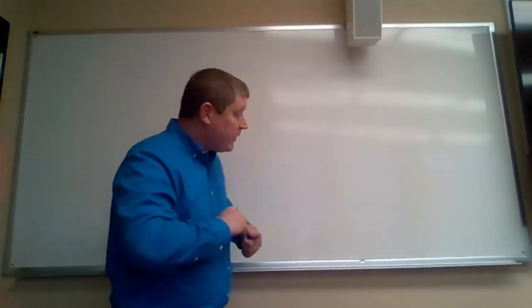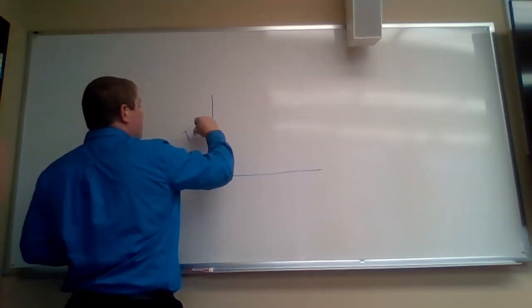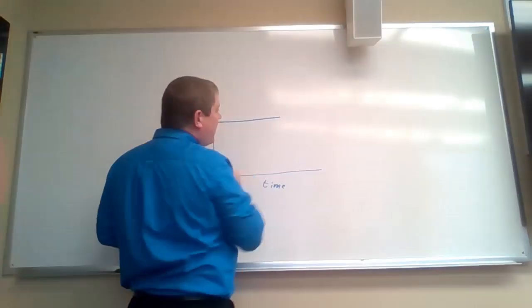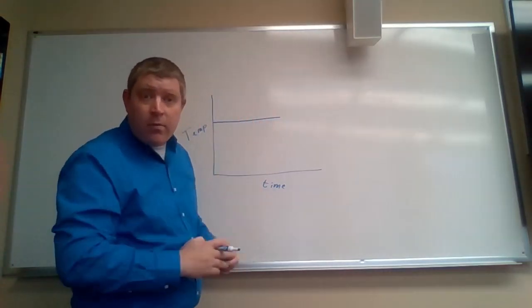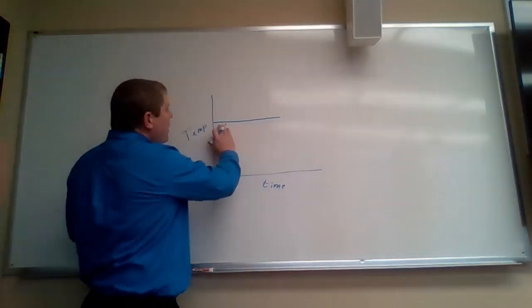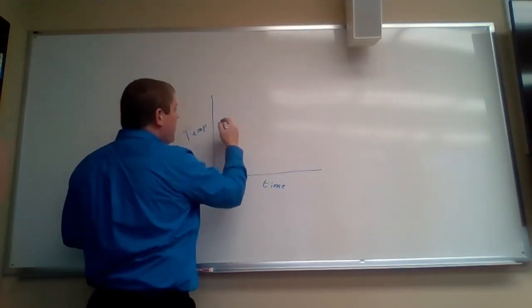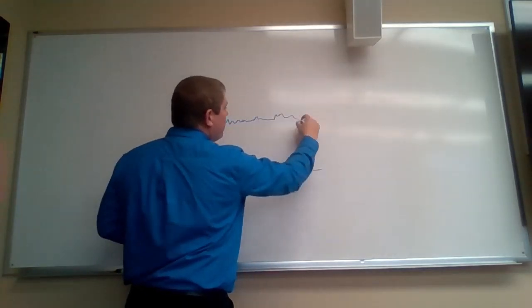And so if we plot what we generally see with temperature on the vertical axis and time on the horizontal axis, what we'd like to see is a nice smooth line, whether it be a flat line if you are just measuring, say, room temperature, or if it has a peak in it. We don't generally see that. Instead, what we tend to see when we're measuring just a constant temperature is some random noise in there.